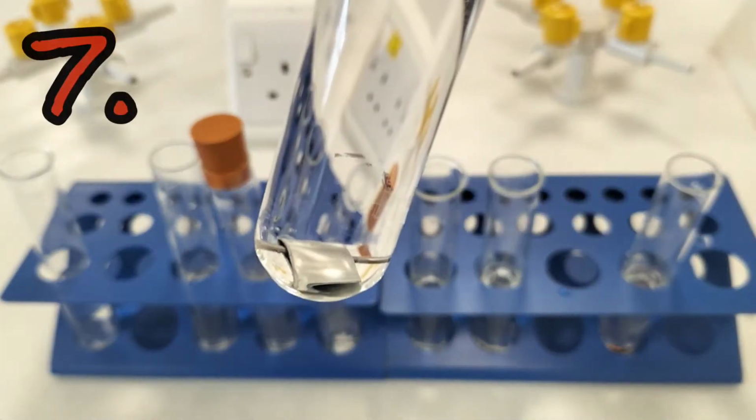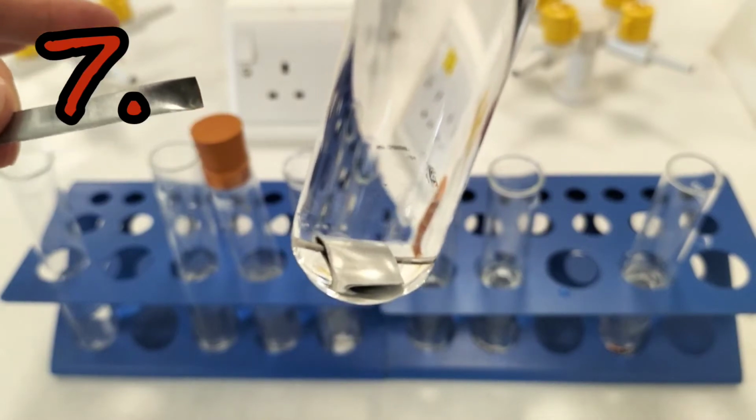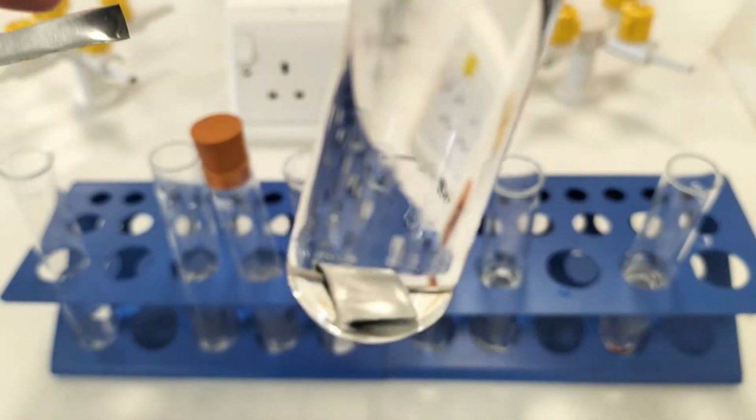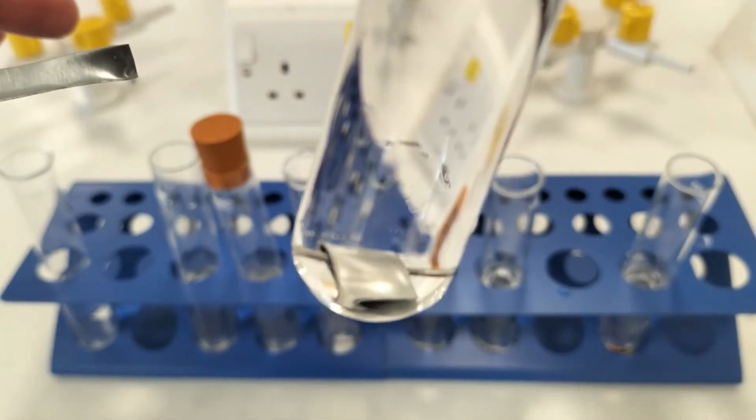Now in experiment 7, I've used this metal, zinc, instead of magnesium. I've wrapped this metal around my iron nail. And in fact, I haven't even bothered to completely cover the iron nail with my zinc wrapping. We're going to see if that has an effect on the rate of rusting.